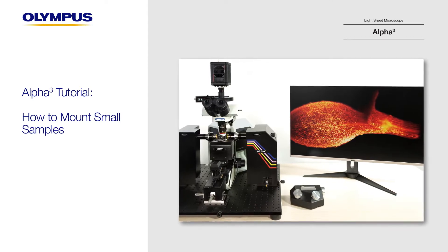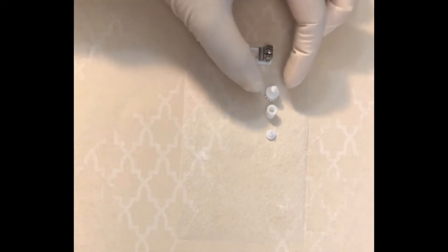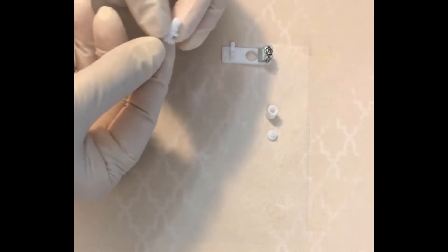In this video we will demonstrate how to mount a small sample. To mount very small samples like spheroids, use the different sized molds and caps in your kit to create a tube for your sample.